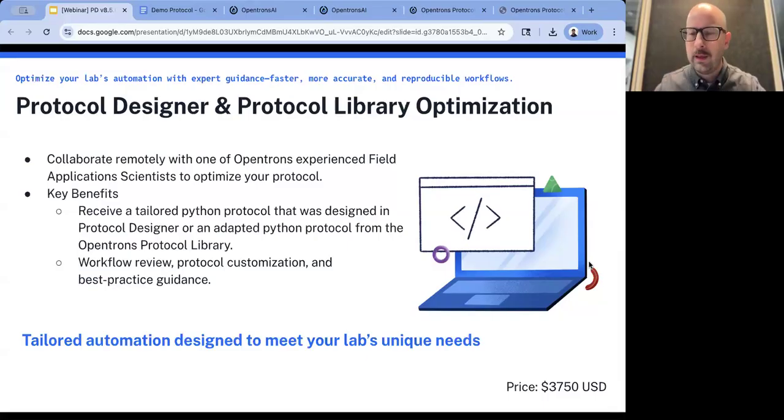Okay, next question. Does PD not show the changes to protocol because they're not necessarily updated in the JSON? Yes, or because the protocols are more flexible than the designer UX. I'm wondering if we were generating updated JSONs as well as updating protocols, they would be reflected in PD for debugging.